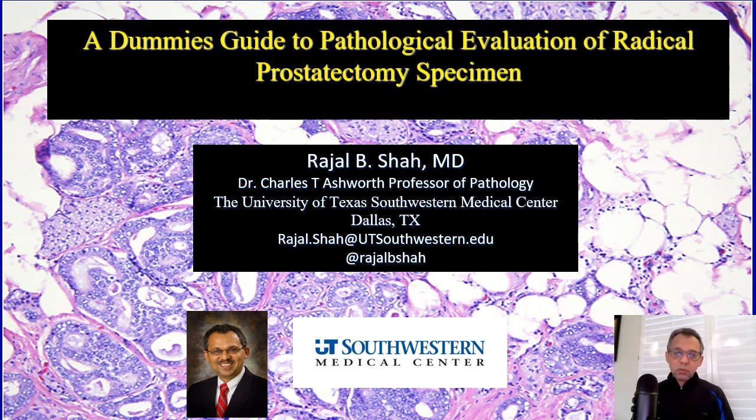So today I try to bring another very important topic in urologic pathology, which is the evaluation of radical prostatectomy specimen. Those who have been in GU service or who handle urologic pathology specimens on a day-to-day basis know that this particular specimen can take away a significant amount of time. So the more organized you are, the more consistent you are in understanding this particular specimen, the more efficient you will be and will provide more critically relevant data in a consistent manner.